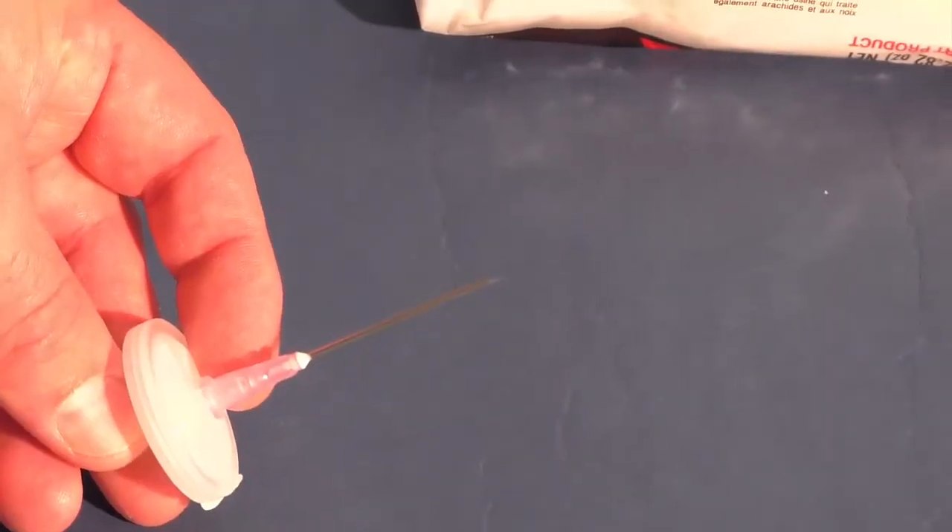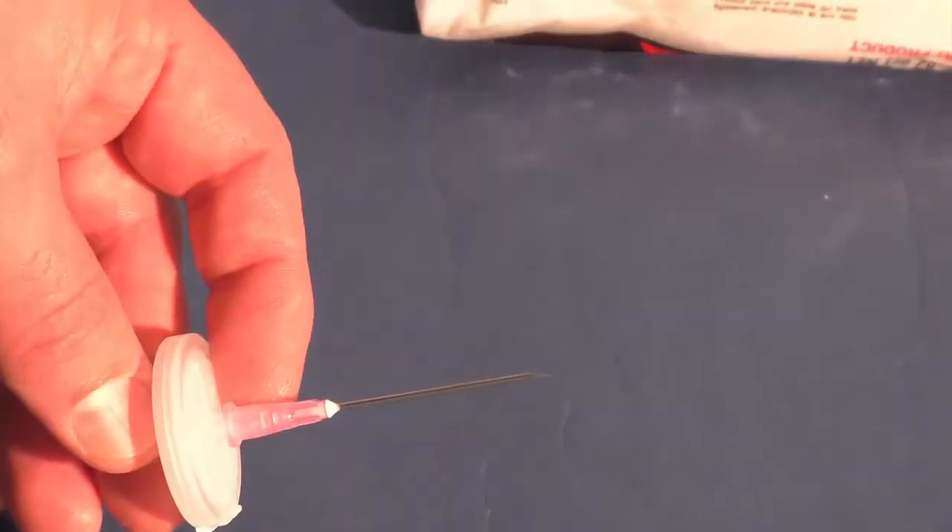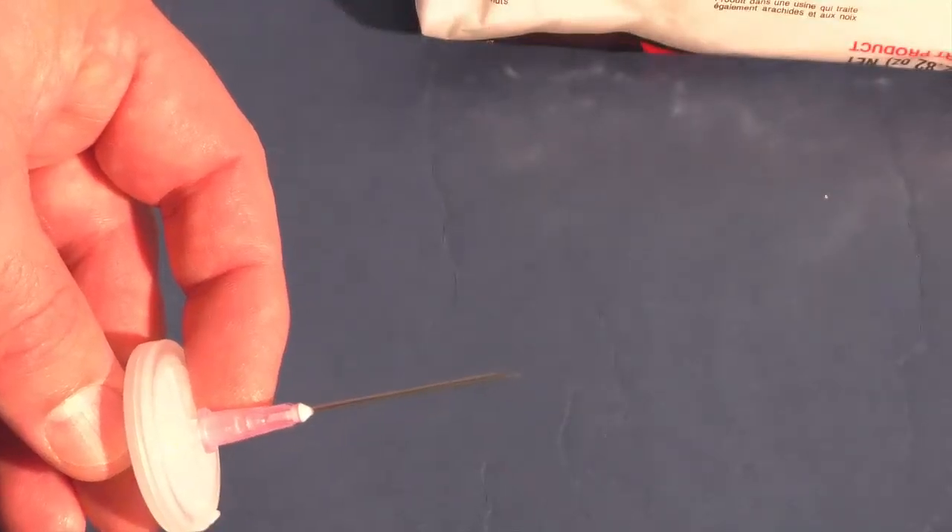The hypodermic needle to be used should be smooth and straight and have no burrs at the point. If there are any burrs at the point it will tend to rip the packaging as you insert the needle, and the hypodermic should be replaced.